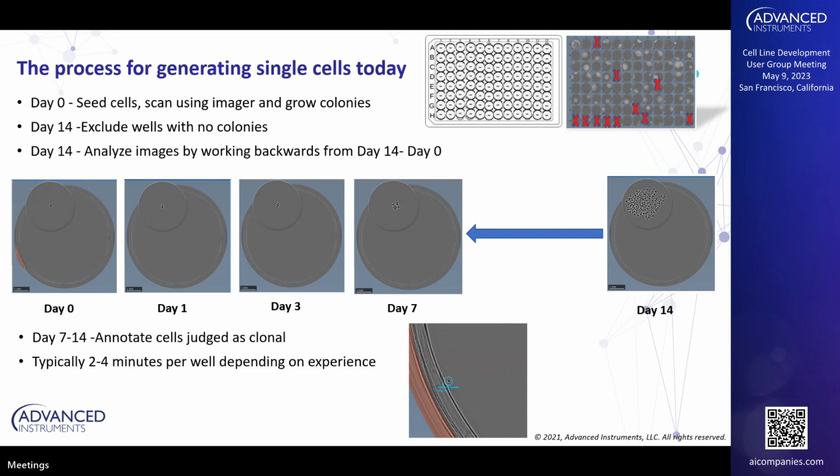So to track back from day 14 and go through all those subsequent steps to day 0, and then label the cell in the well, roughly. Sorry, a minute? Okay, less than a minute. Yeah, that's fair.